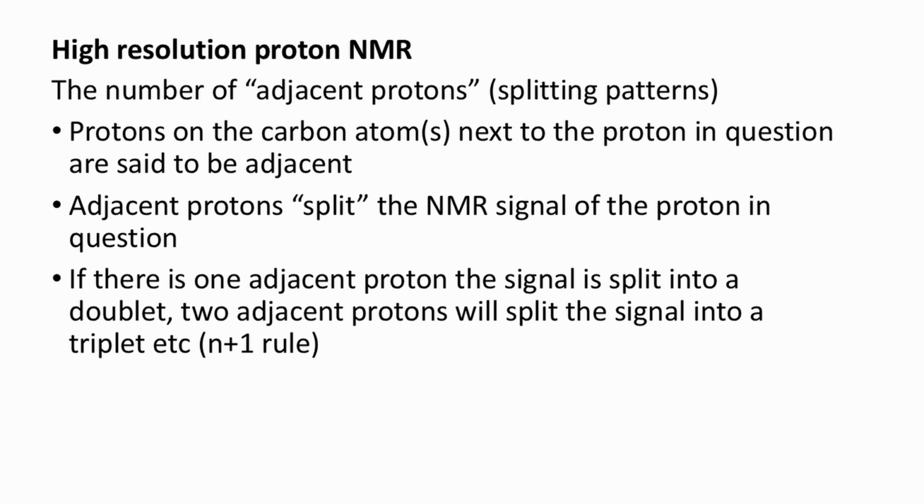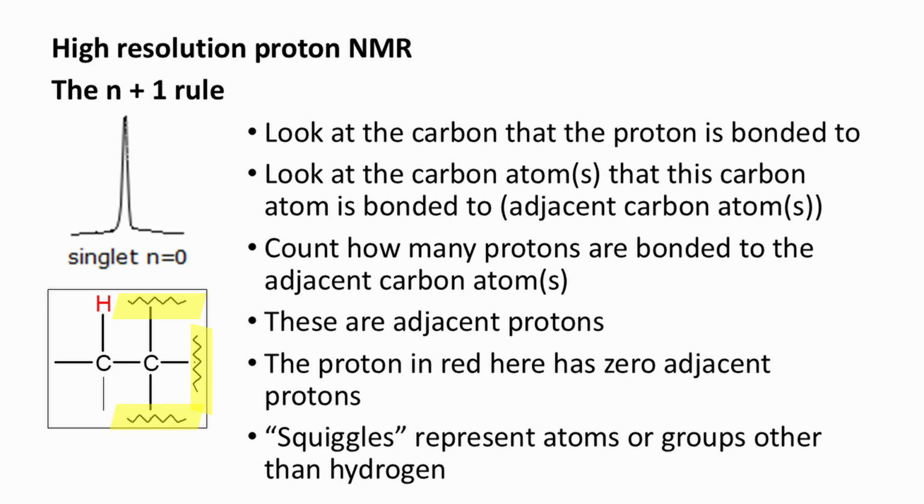I won't go into detail here about why splitting occurs. It is much more important for A-level exams that you can recognise and interpret splitting patterns rather than explain them. In reality, there are exceptions to the N+1 rule. Knowledge of these exceptions will not be challenged in exams.